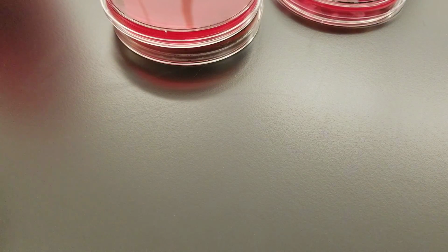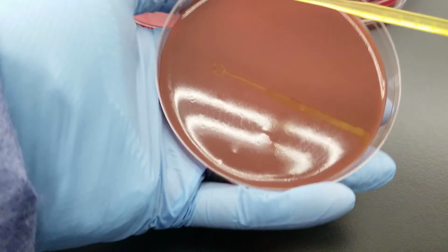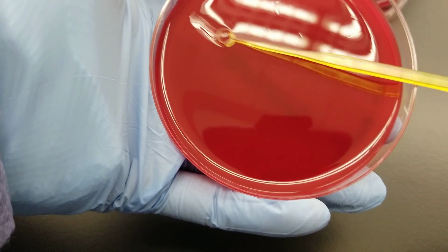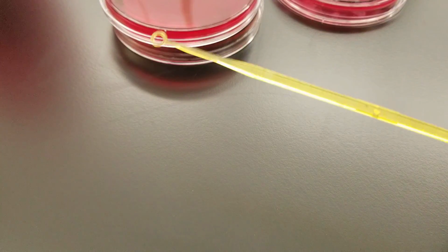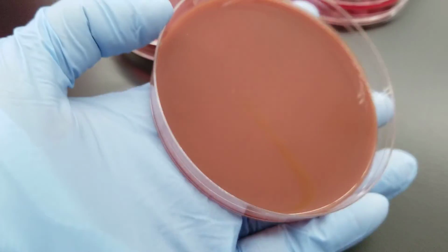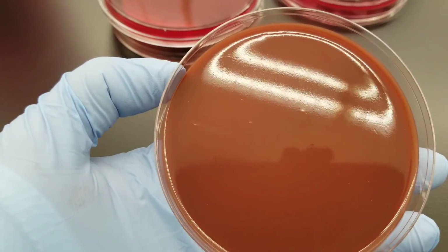So I'm going to get a beautiful colony here, and it's isolated, it's a pure colony, and we know that all of those are the same anyway, but I'm going to do a line here, a line here, and then a line on the Brucella blood agar plate, and that's to introduce the organism onto the plate. And then I'm going to shake out a new loop and spread that organism around. So you can see the line there.